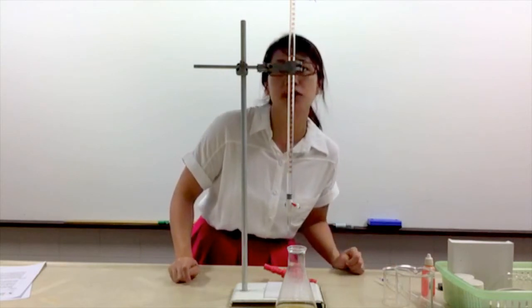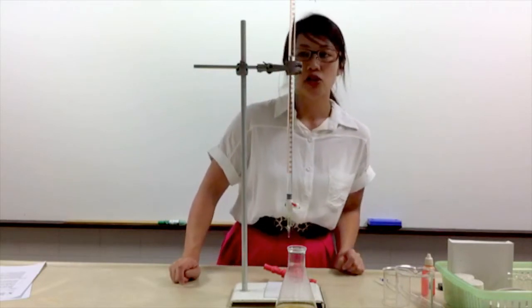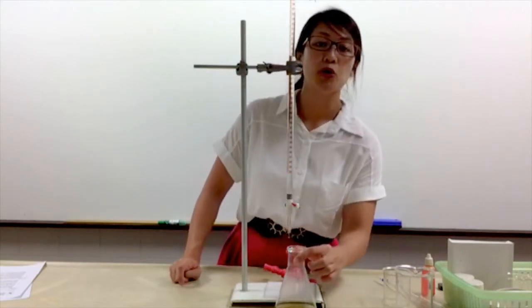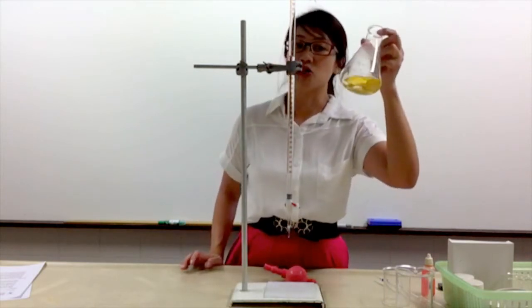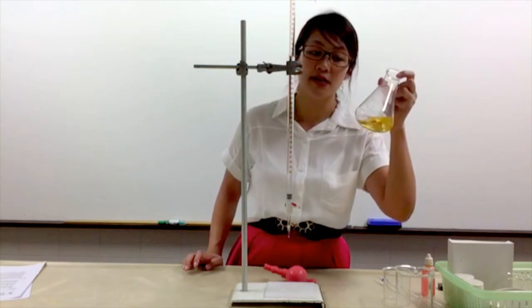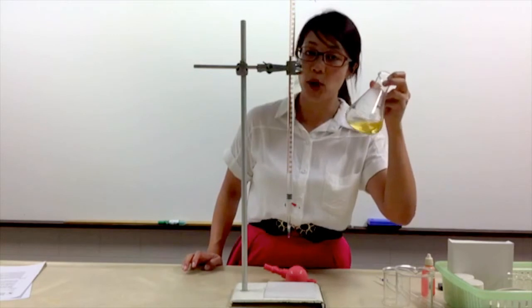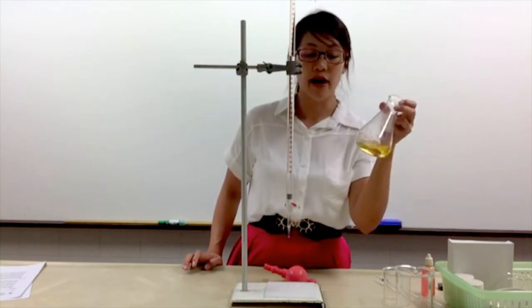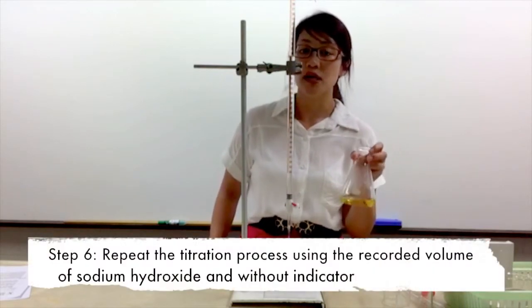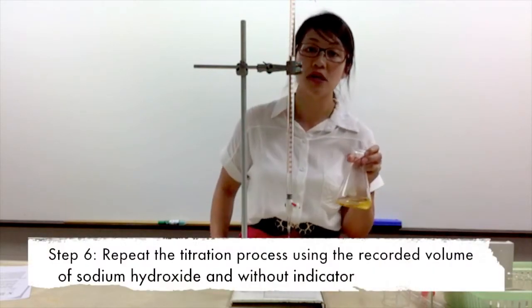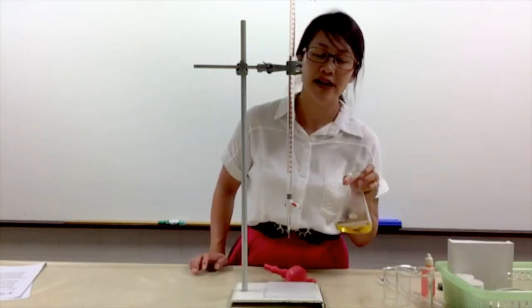So I will need to repeat the experiment. Why do I have to repeat the experiment? The salt is contained inside, however it has been contaminated with your indicator. Can you see that you have prepared a pure sample of the salt? No, you can't. So this time round we will need to repeat the experiment using 26.2 cm³ of alkaline and no indicator. Let's repeat the experiment.